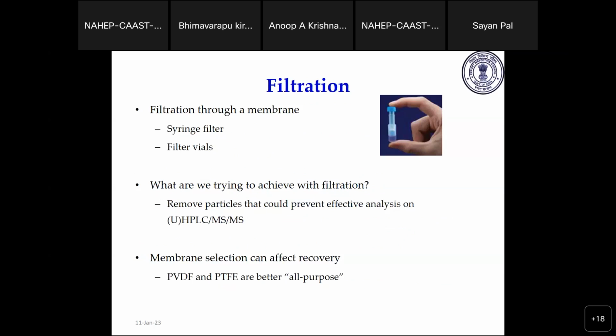So that the final extract which we put into the instrument is clean and doesn't affect the instrument, which I was telling. Because what you put inside the instrument, your instrument can go bad, like your column, your cones, your pump, everything can go bad, because if the final extract has some interference or some matrix still remaining, this can affect the LC-MS instrument which is being used.